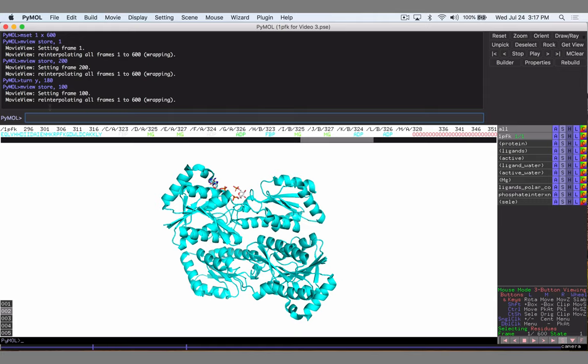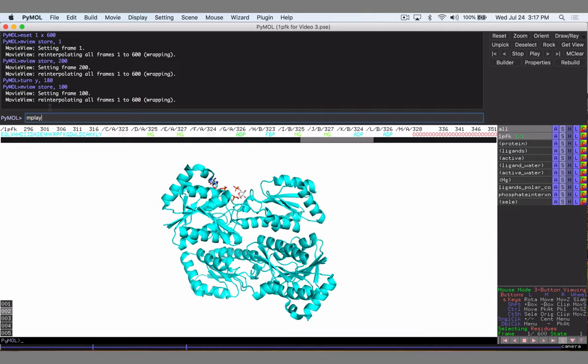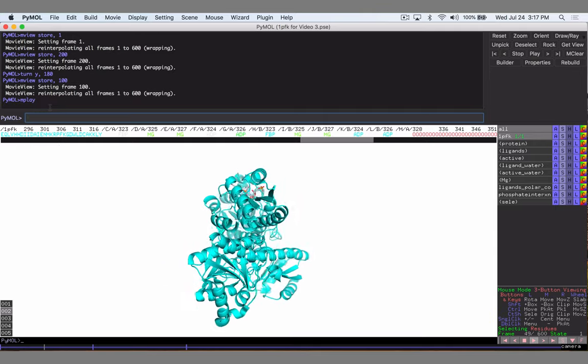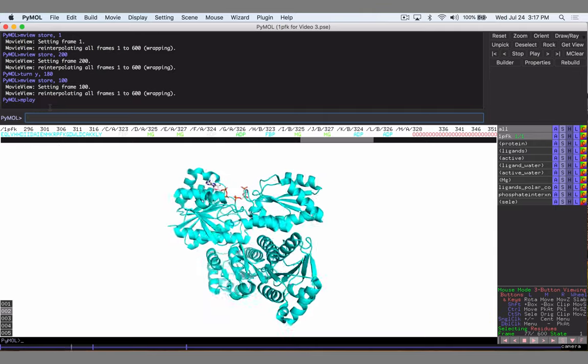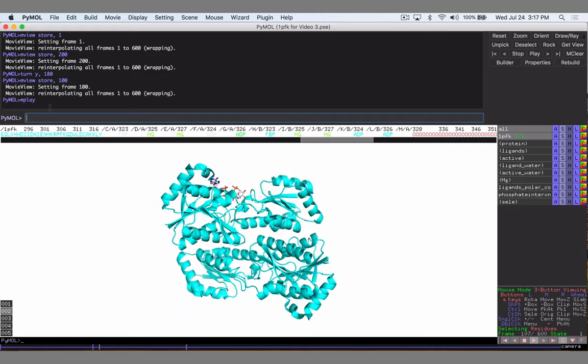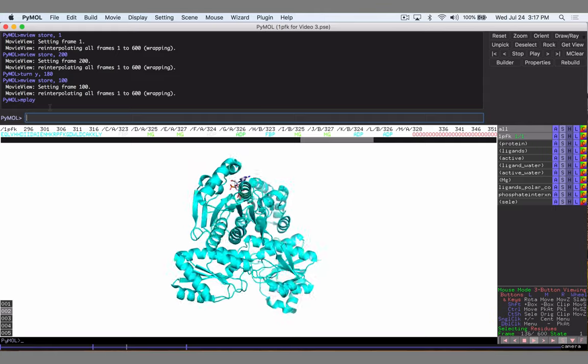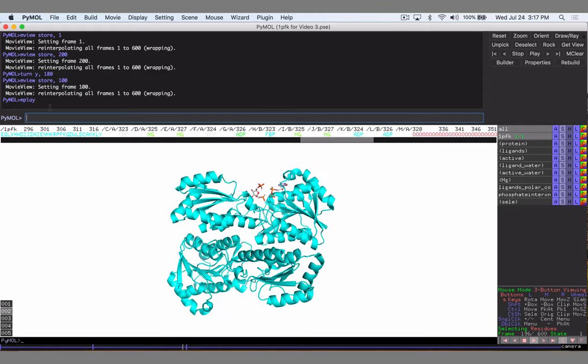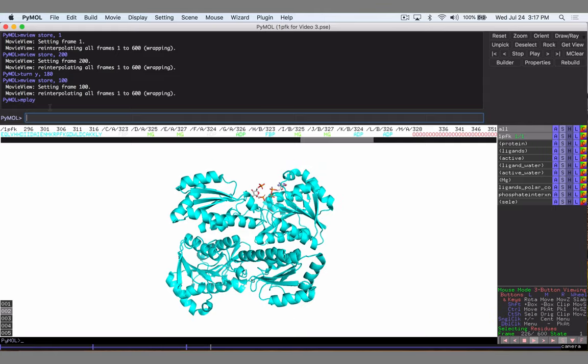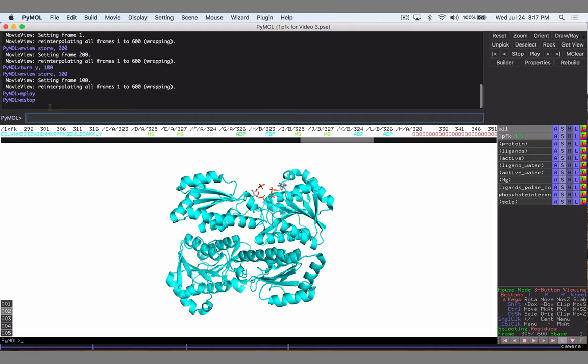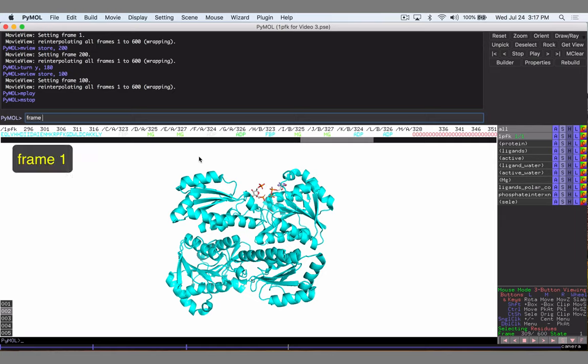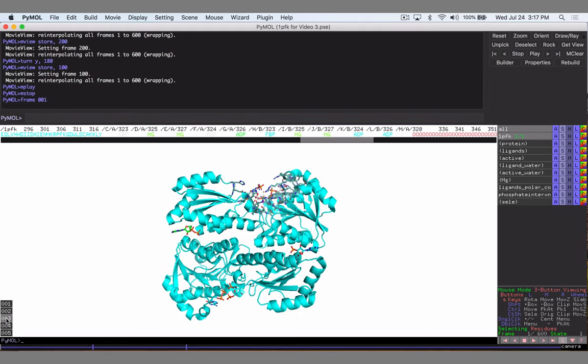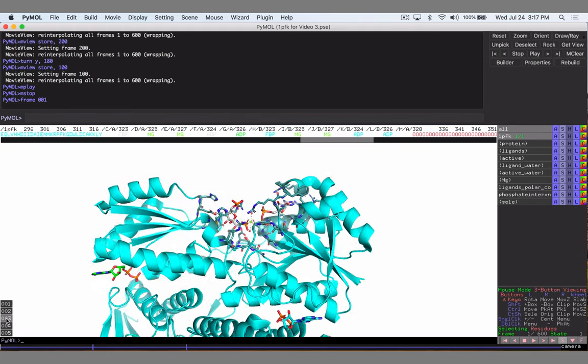So now we can type mplay just to see how our movie is doing. That'll show us our movie. It spins, it comes back around, and then we don't have anything else so it's going to do nothing for a while. So let's hit mstop so we're stopping playing our movie. I think we can type frame one and go all the way back to frame one if we wanted to basically rewind.